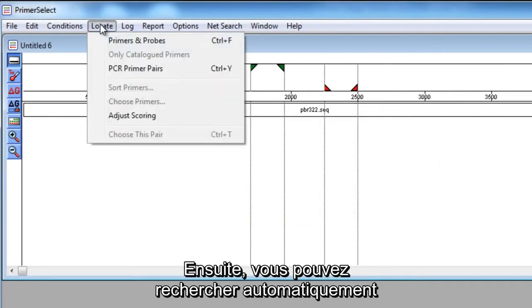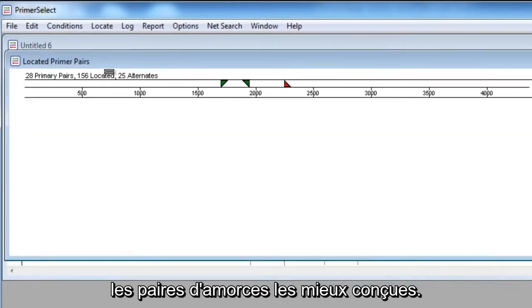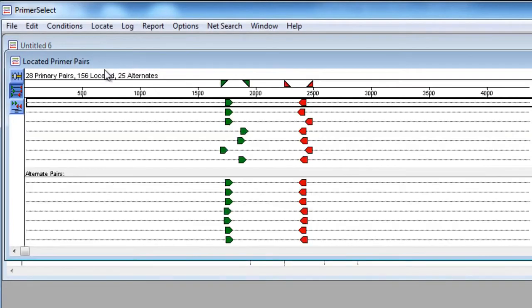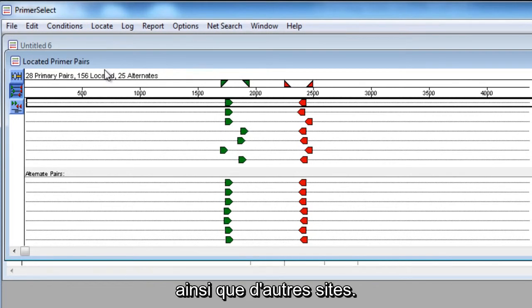Then, you can search automatically for the best primer pairs. Primer Select allows you to see multiple major primer sites simultaneously, as well as alternate sites.